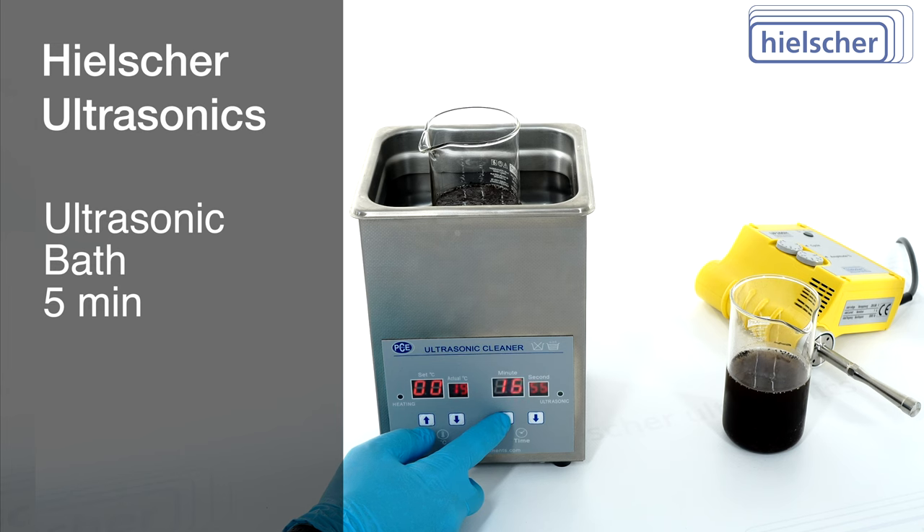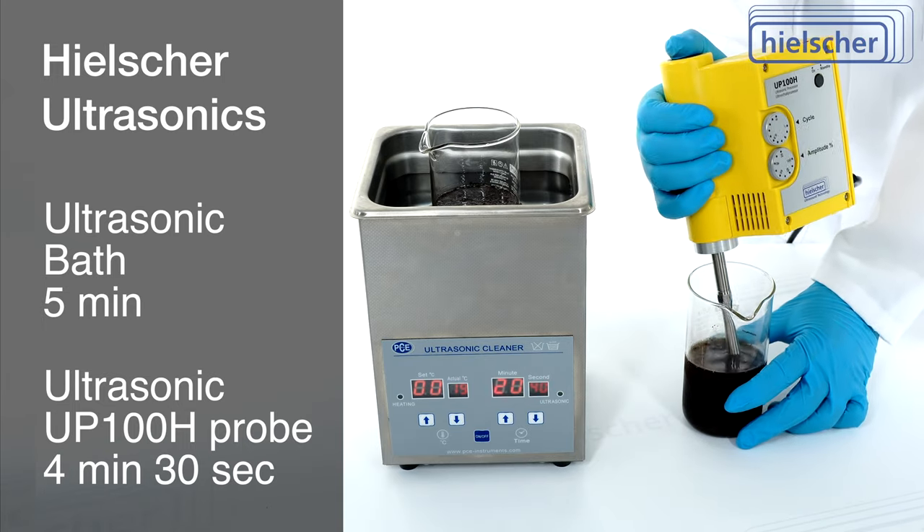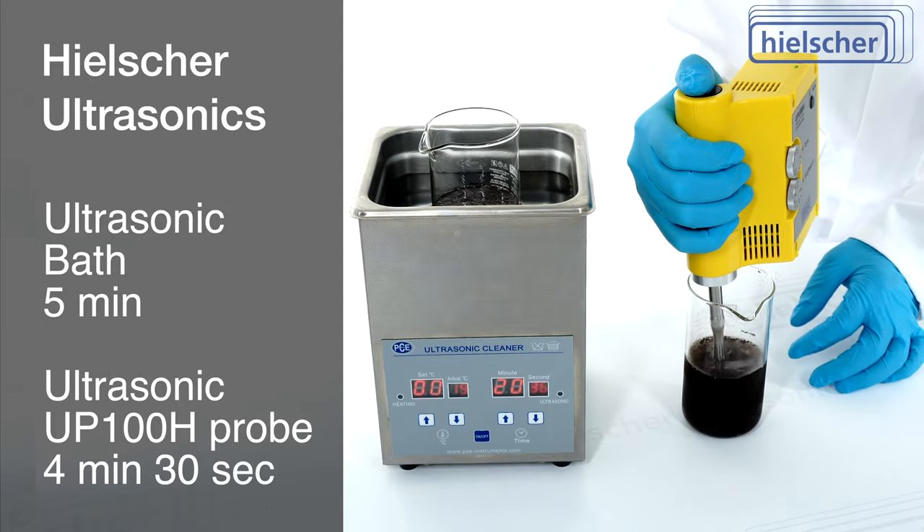The first beaker is sonicated for 5 minutes in an ultrasonic bath. We sonicate the second beaker with the UP100H for 4 minutes and 30 seconds — 30 seconds less than in the ultrasonic bath.